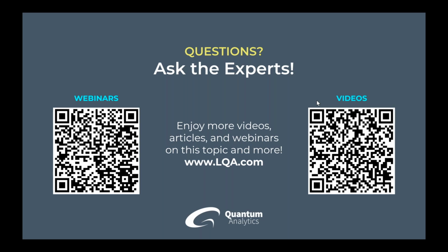Awesome. And you mentioned the RSD. How about the accuracy of phthalate analysis? So here today, we only show just a few figures related to the RSD, but the actual ASTM method talks about that. It gives a lot more information. So of course, it goes more in-depth into sample preparation, calibration curve, accuracy, and precision. So we show a couple of examples here for those 3 PVC samples that were also spiked with some type of plasticizer. But again, here today, we only show the RSD percentage.